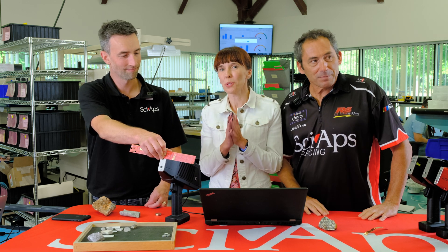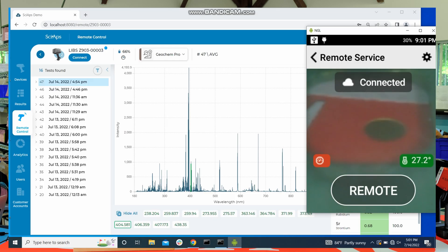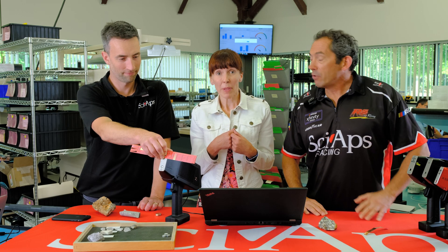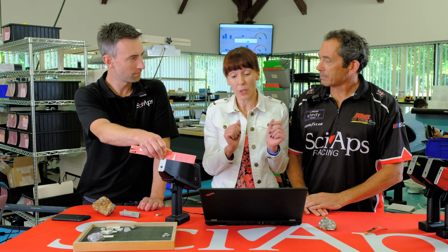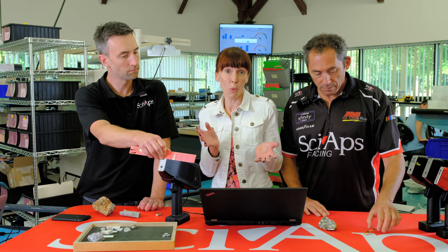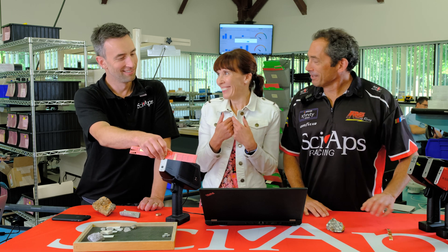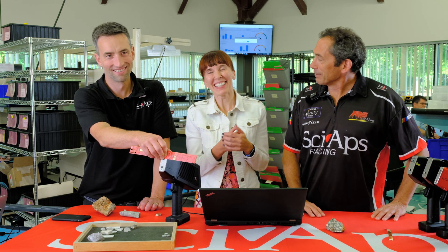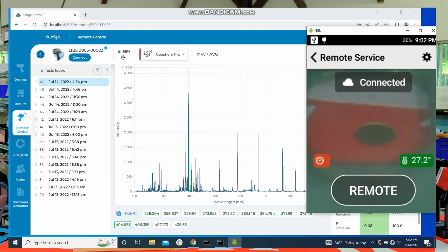Today we would like to introduce a new feature in our software. Previously we were talking about export management in the cloud. Now we have a local version of desktop application that you could use to control your analyzer remotely. Some customers prefer to have a local version because they may not have Wi-Fi coverage — they could be in the middle of nowhere. So they're in the middle of nowhere, they don't have Wi-Fi, but they do have a connection. As you can see on my laptop, I don't have any Wi-Fi, and the analyzer does not have any Wi-Fi, but we could still take a test.